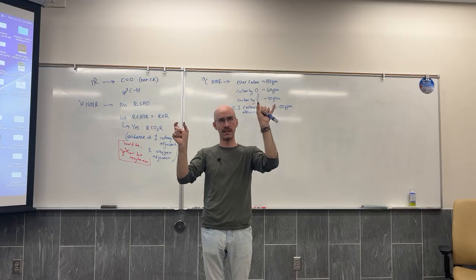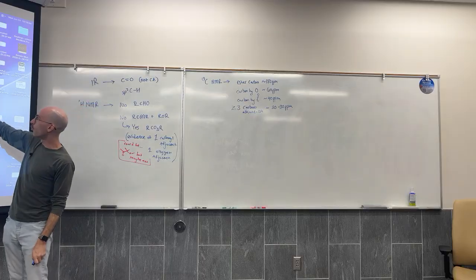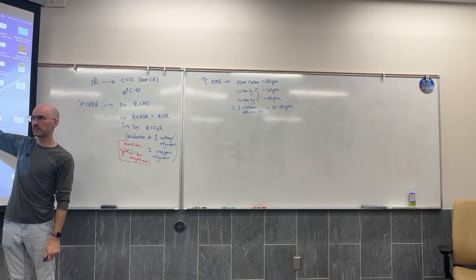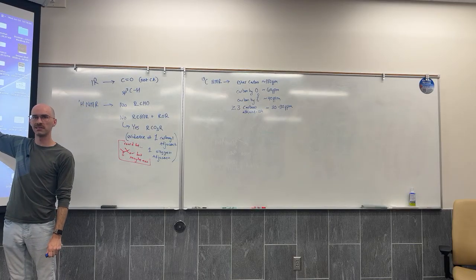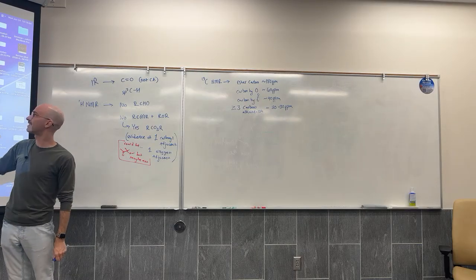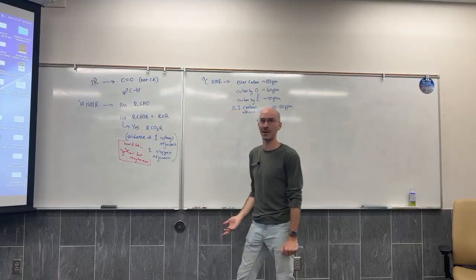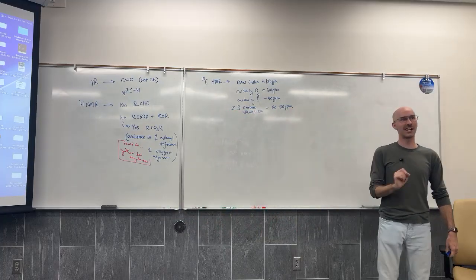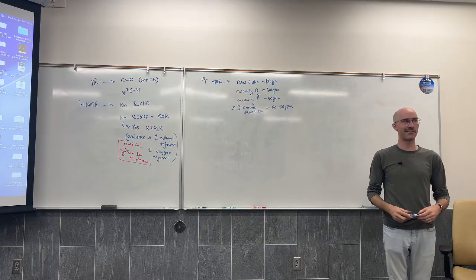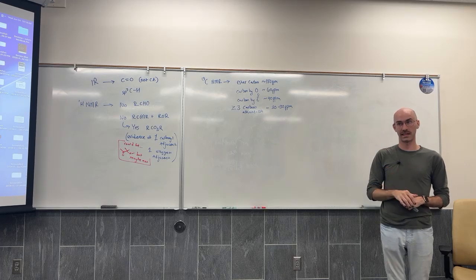But that would mean 2 identical carbons, and that would mean one of these 3 signals is actually 2 carbons and not 1. But carbon NMR doesn't consistently give a height. Carbon NMR can't be integrated, so carbon NMR just tells me how many types of carbons I have and not necessarily how many exact carbons I have.